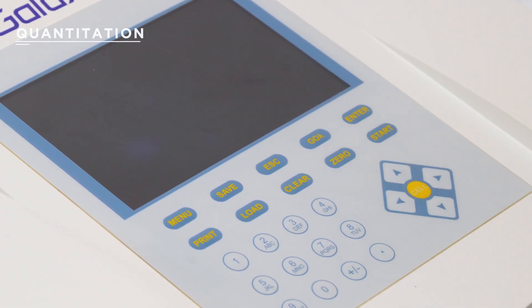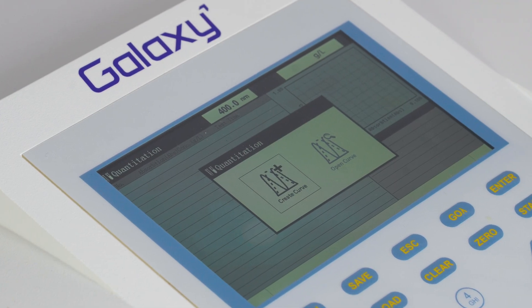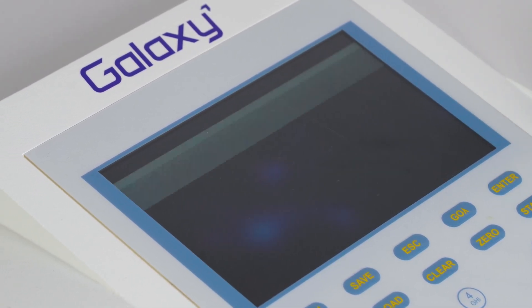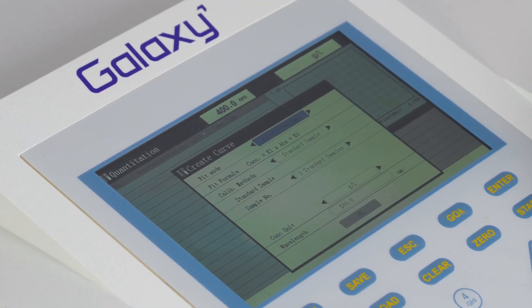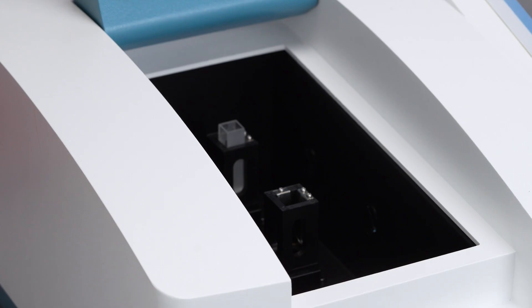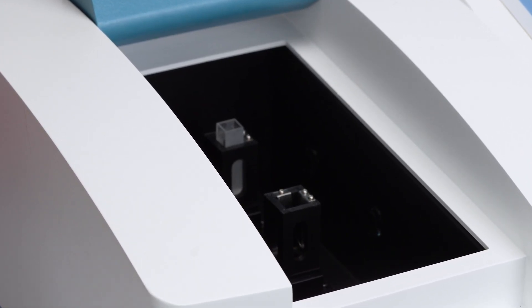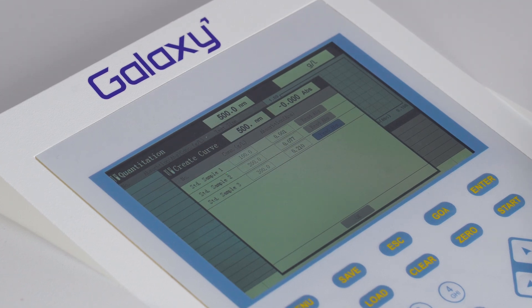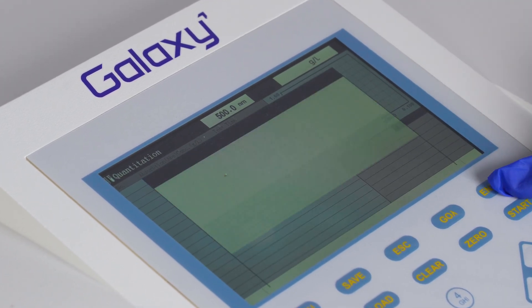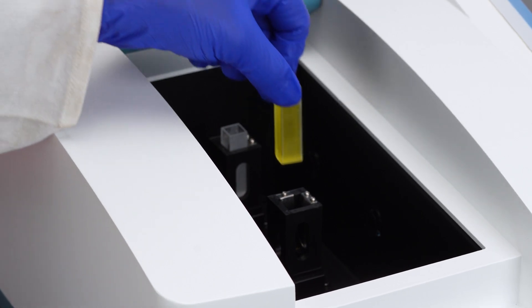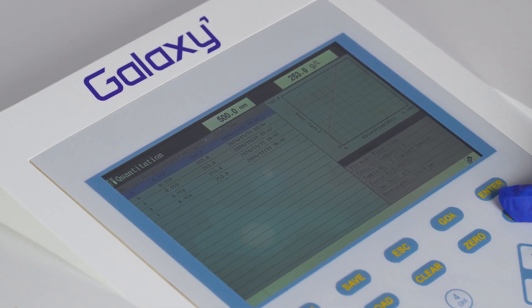Quantitation lets you plot a standard curve for concentration measurements. Select quantitation and input parameters such as fitting method, concentration unit and wavelength. Perform blanking with a blank solution. Measure standards one by one. Once all standards are measured, the curve will be plotted. To measure an unknown sample, blank first, then insert the sample and press start.